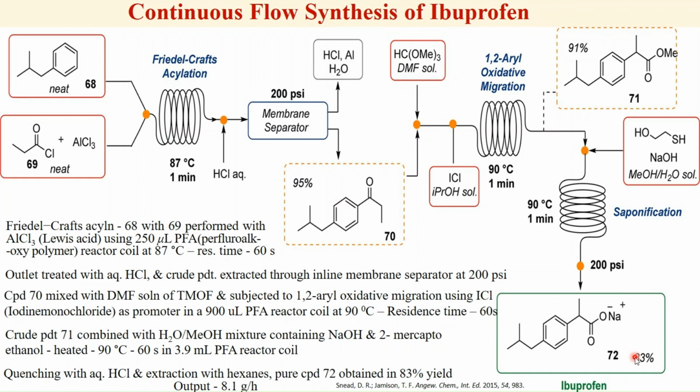These are the salient features of this ibuprofen synthesis. We use PFA reactor. It's a Teflon reactor which is highly resistant to chemicals and highly resistant to thermal energy, and the volume of it is only 900 microliters or 470 microliters and so forth.